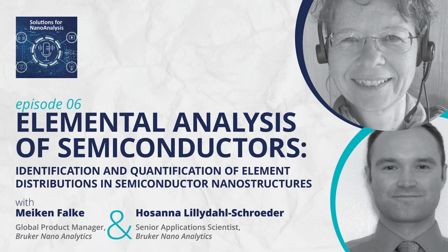And then there is more to semiconductor industry. It's not just the functional materials which are of interest, but also other things which might cause device failure and need monitoring and investigating. For instance, remains of the etching process, like fluorine from fluoridic acid or chlorine. And it's important to see where they are and if they have any unwanted effects. So this results in a mixture of light and heavy and medium-sized elements. And as I said, EDS is really good at tackling those.